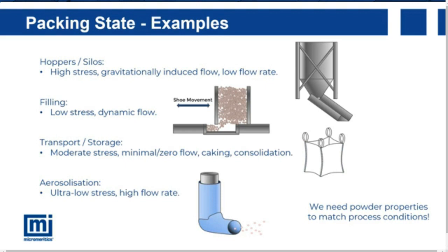We can see from these examples that even if we were to be using the same powder in each of these processes, the flow behavior of the powder would necessarily be different in each case. With this in mind, we have to be certain that we not only match powders to the appropriate process conditions, but also that we apply our powder flow testing in a way which relates the correct test procedures to the appropriate working conditions.